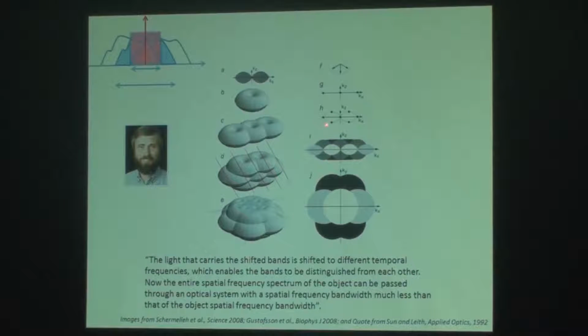The next slide will show you how the three different locations of those three beams he was using are spatially different in the z direction, as you can see. So then you can register the information back in the back focal plane of the objective, because you can discriminate where these frequencies are coming from. If you know the location, then you can put back where those frequencies are supposed to be. As you can see here, instead of collecting one sequence of image, you collect 5 phase images.